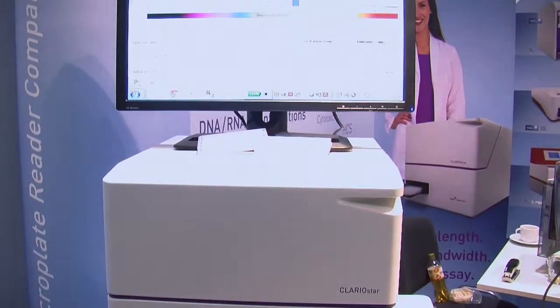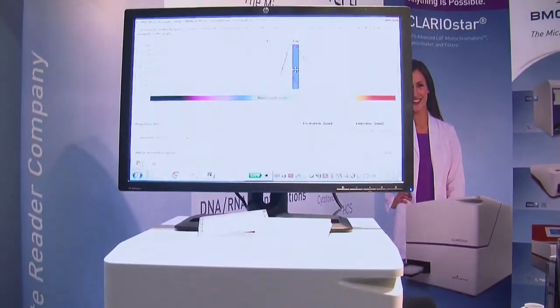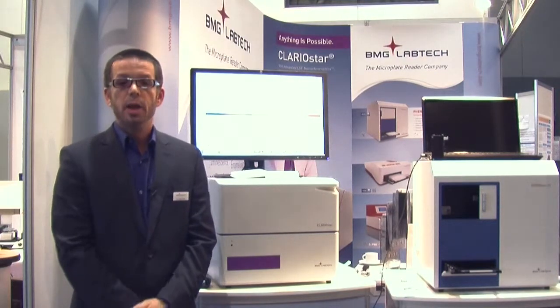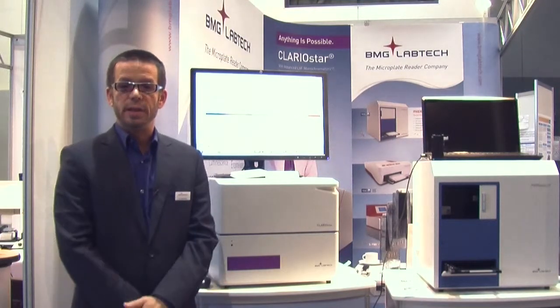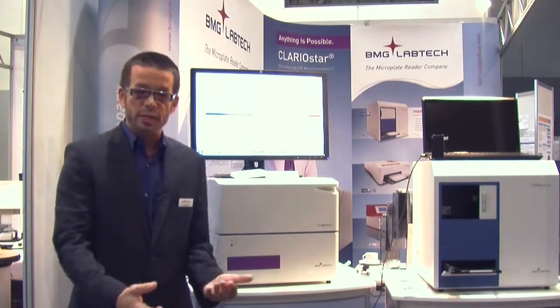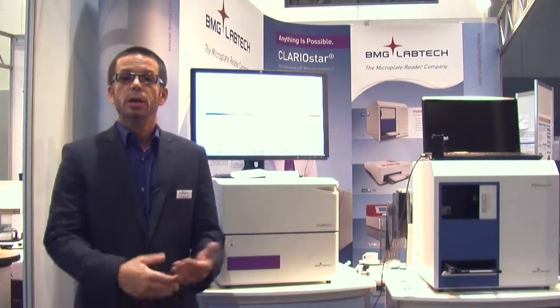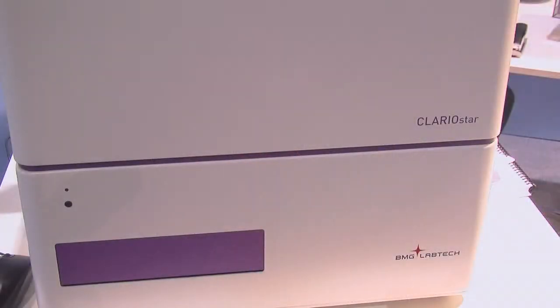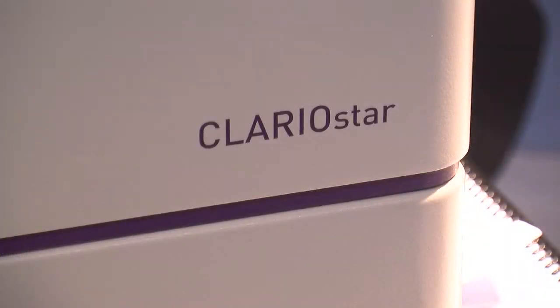You can get the greatest sensitivity with the greatest flexibility: greatest sensitivity with the filters, greatest flexibility with the monochromator. You also have key features such as a spectrometer for absorbance, laser light sources, injectors for kinetic assays, top and bottom reading for cell-based assays, and whatever features you could possibly imagine. Our slogan for the CLARIOstar is: anything's possible with the CLARIOstar — any wavelength, any bandwidth, any assay.